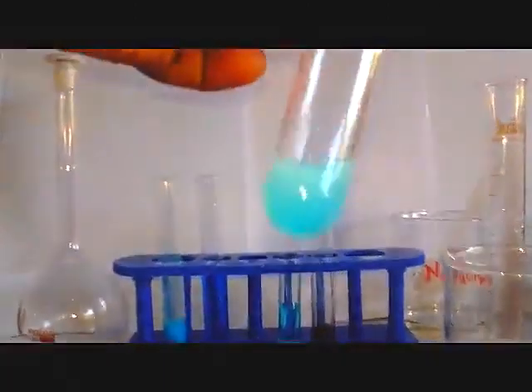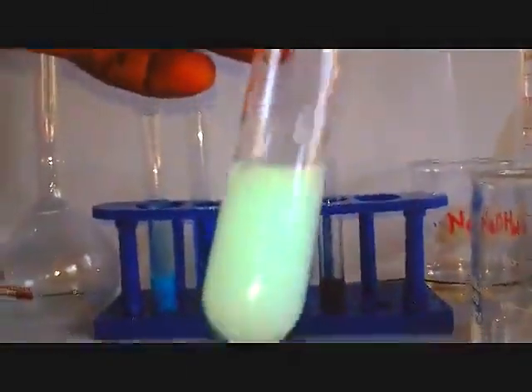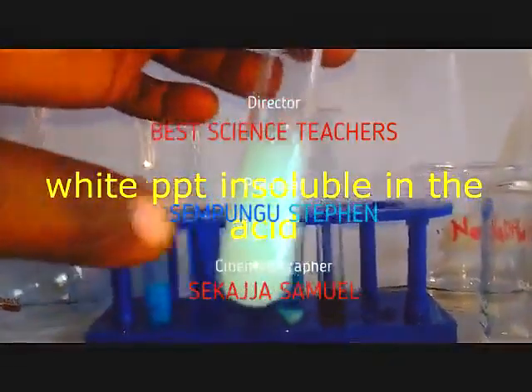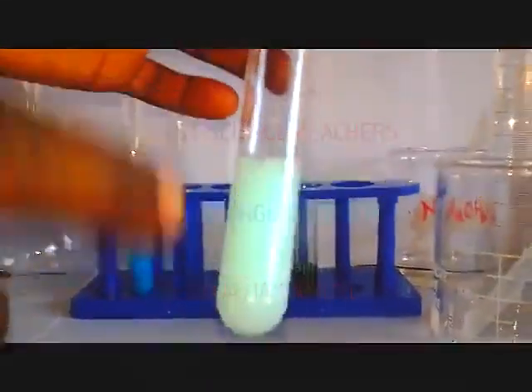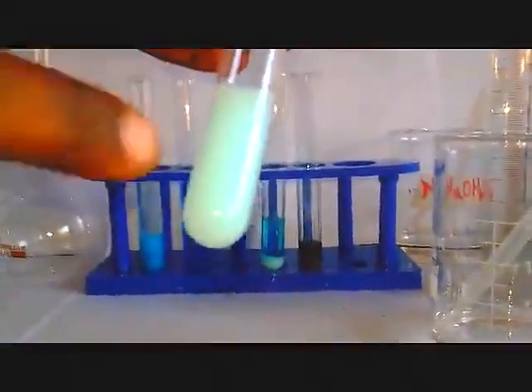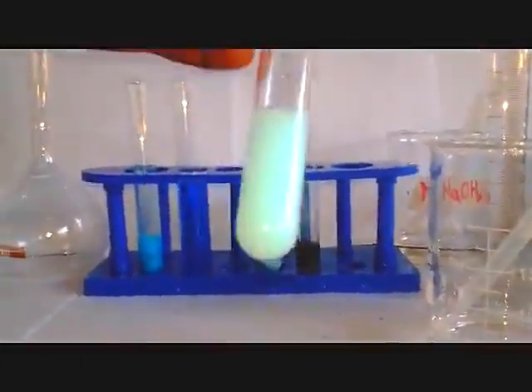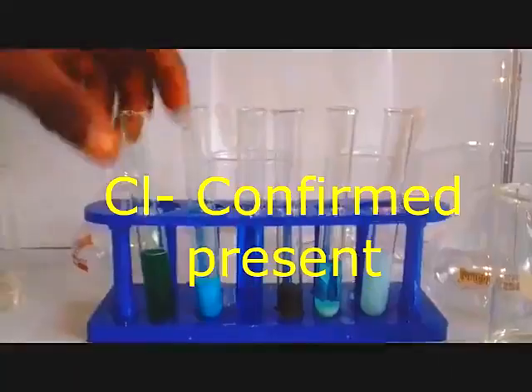So we are seeing we are having a white PPT there. And let's add also nitric acid. So it is non-dissolving. So the observation is going to be white PPT insoluble in the acid, and this is a comparative test for chloride ion, because the PPT is due to formation of silver chloride, and it is insoluble in the dilute nitric acid. So we are going to say white PPT insoluble in the acid, and the deduction is going to be chloride ions confirmed present.